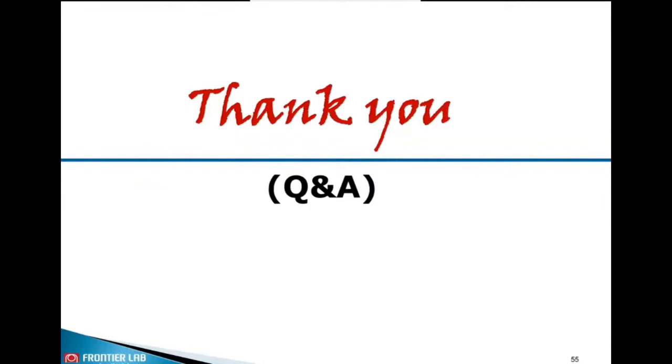It's like isothermal. So you can try the sample at 100, at 200, at 300 and 400. Then you get this information four times and consolidate. On the other hand, if you use a multi-shot, then you can straight away do a 100 to 300 ramp up. So you get all these four analysis data in one run. So to answer your question, it is possible, but still it cannot be a 100% correct approach.